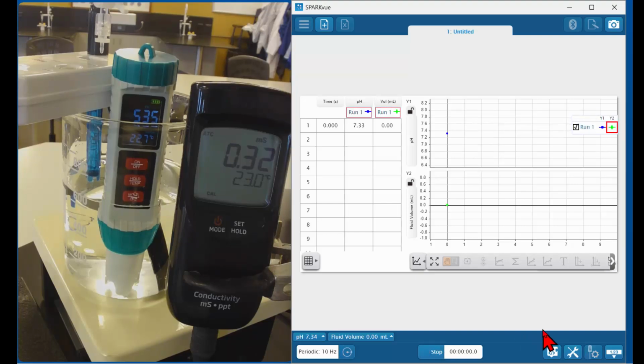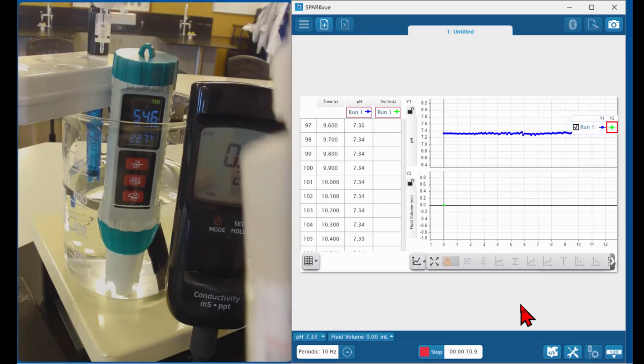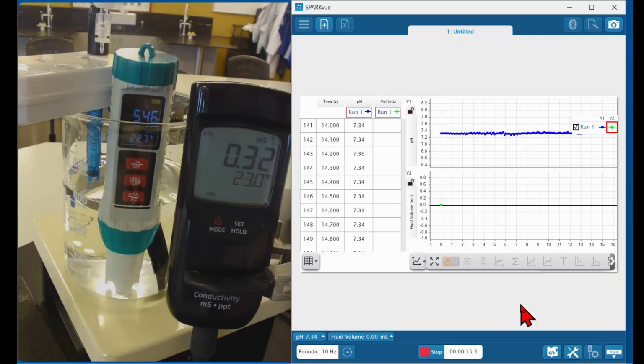So now I have two conductivity meters, and the problem is they're not Pasco, so I might be at part 3 when the Pasco one comes in, which would be the preferred one. And so you've got two here. The black one's quite an expensive one, the other one not so.